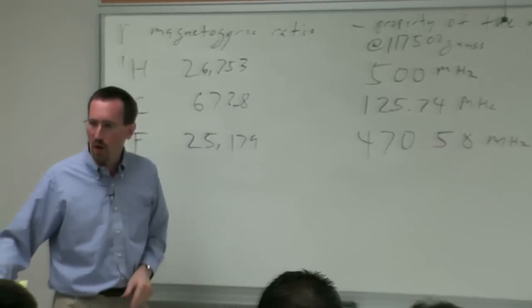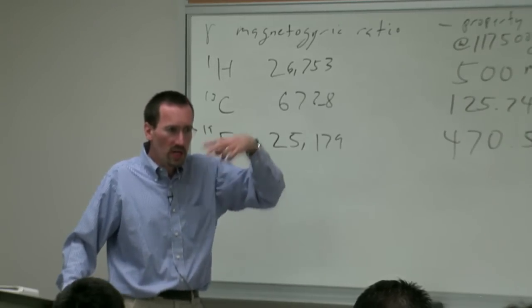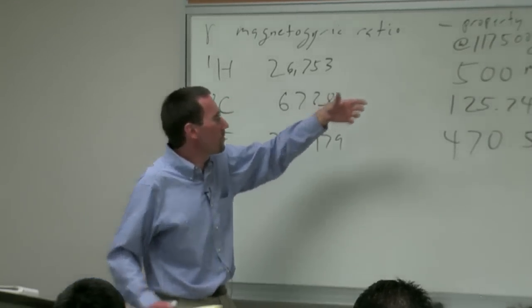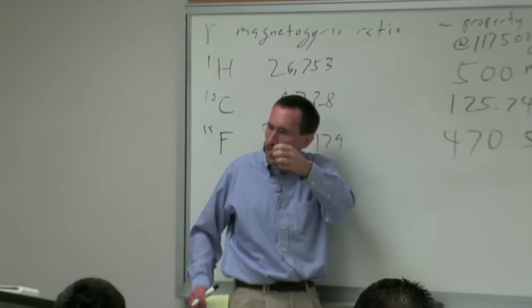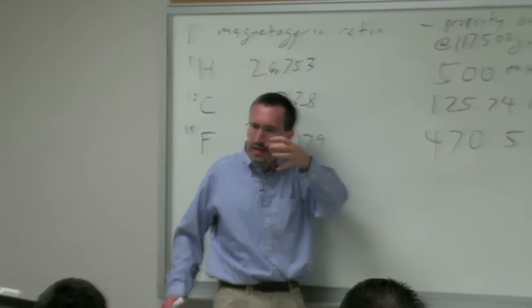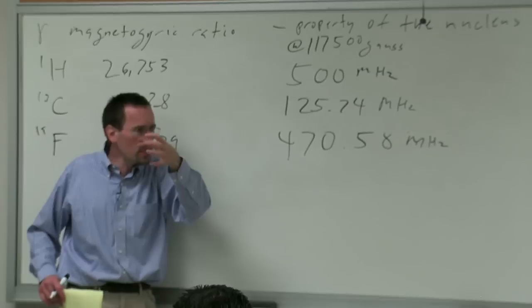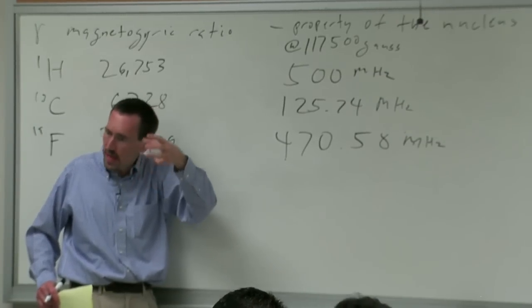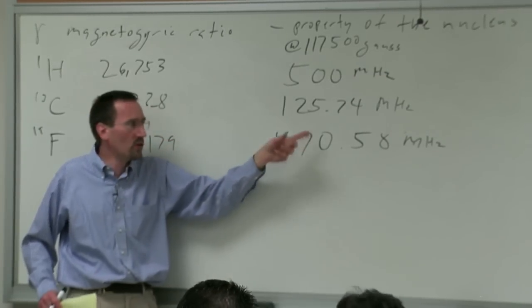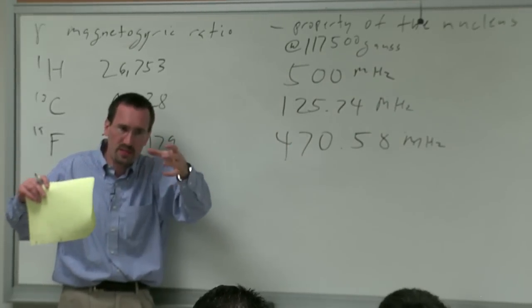So often if you want a really good proton NMR, you will use a special probe where the coil that's tuned for proton is inner and close to the sample, and the coil that's tuned for other nuclei is bigger and further away from the sample. That sort of probe won't be as good for carbon-13 because you have the coil that's good for C13 further away from the sample.